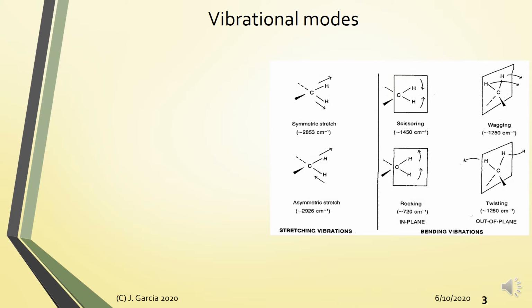So if you remember, the theory of IR is related to Hooke's law. Hooke's law tells us about the frequency that you need to induce vibration in a given spring.